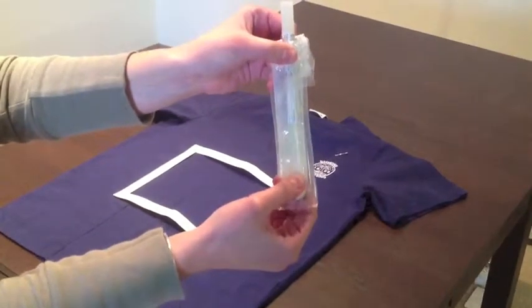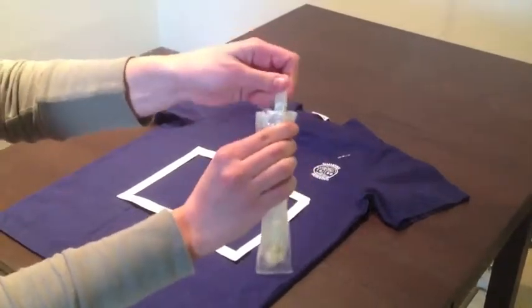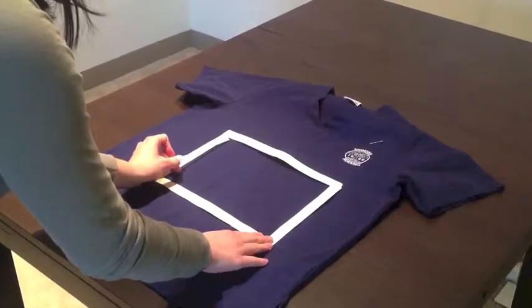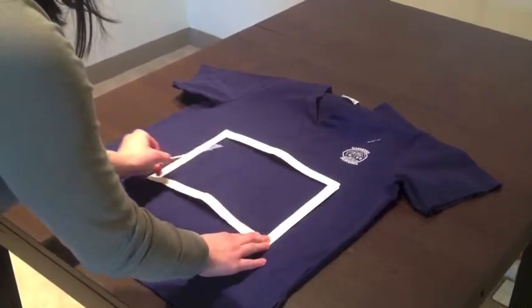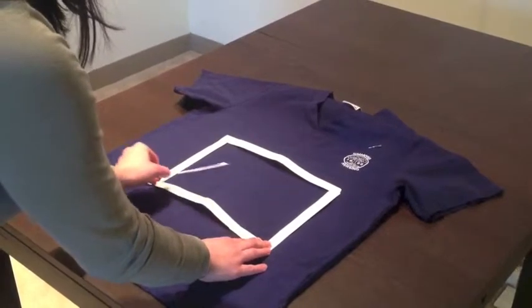Only remove the swab when you are sure you are ready to collect your sample. Starting in the top left corner of the template, move the swab from right to left while rolling the swab in between your fingertips. It is important that you do this slowly and carefully so as to swab every square inch within the template.